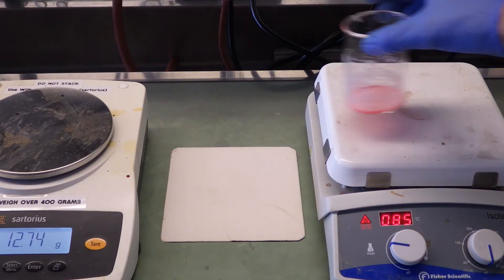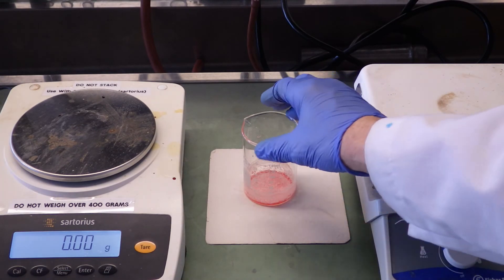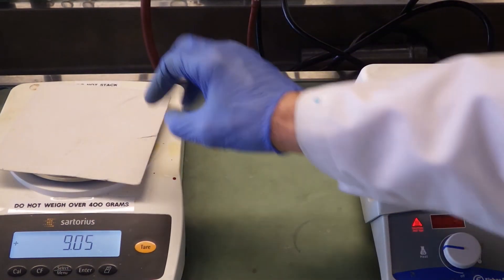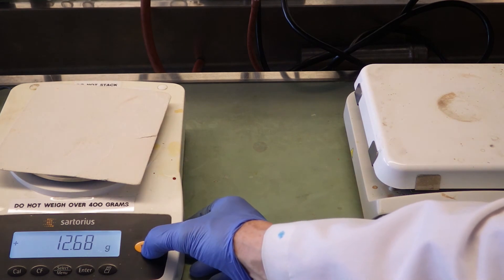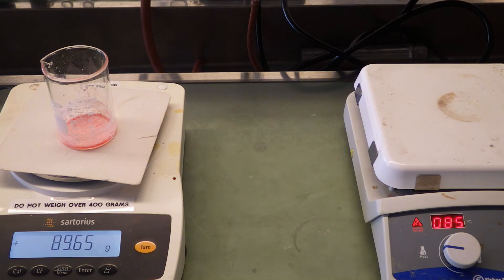And let's get our first mass. That white plate is a fiberglass plate and so it just protects the balance from the hot beaker. Here's our first mass.